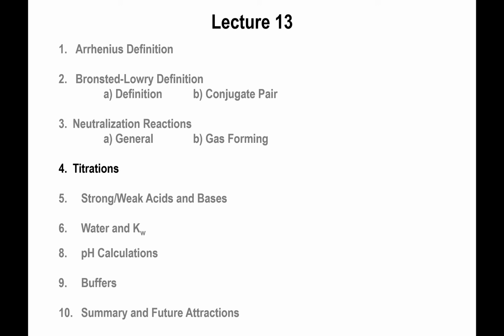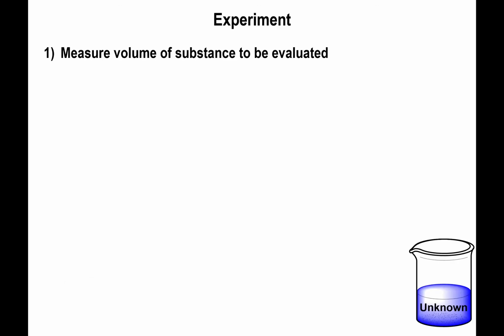All right, titrations. We're first going to talk about the overall setup for the experiment. Pretty much what happens is that you have the volume of a substance that you need to evaluate.